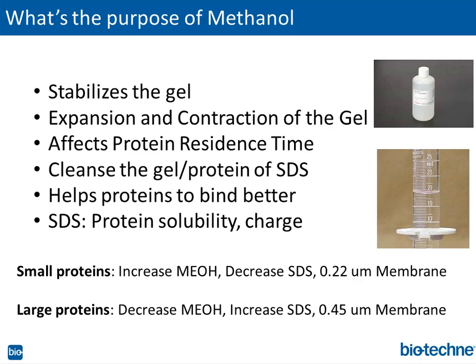You're going to have this kind of asymmetric trapezoid type. If you take the gel and you put it in the transfer buffer with no methanol, it's going to be very asymmetric, and it's not going to be very stable. So the first thing that methanol does is it stabilizes your gel, okay, because you want a nice stable environment for those proteins to transfer.